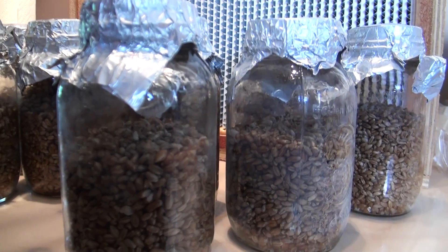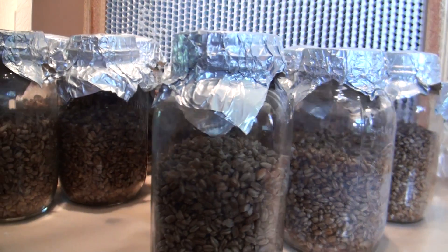We're doing this in front of a laminar flow hood, just trying to stay as clean as possible. But as usual, you don't absolutely need a laminar flow hood — just try and do it in the most sterile way possible. So we're going to hop into the lab and inoculate some grain jars.